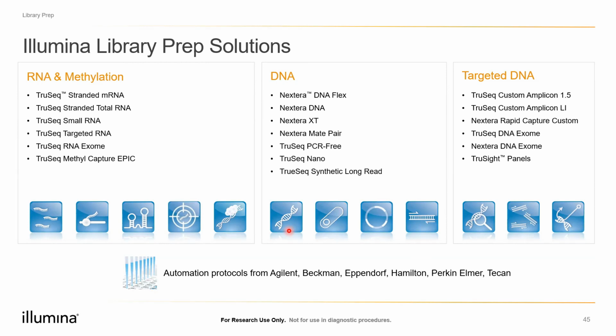and whatever data you require, and the number of samples and the amount of data you want, accordingly your run can be set up. Basically here you target a very small read length. It is single end. So for your miRNA, you will go for single end because it's a very small size.